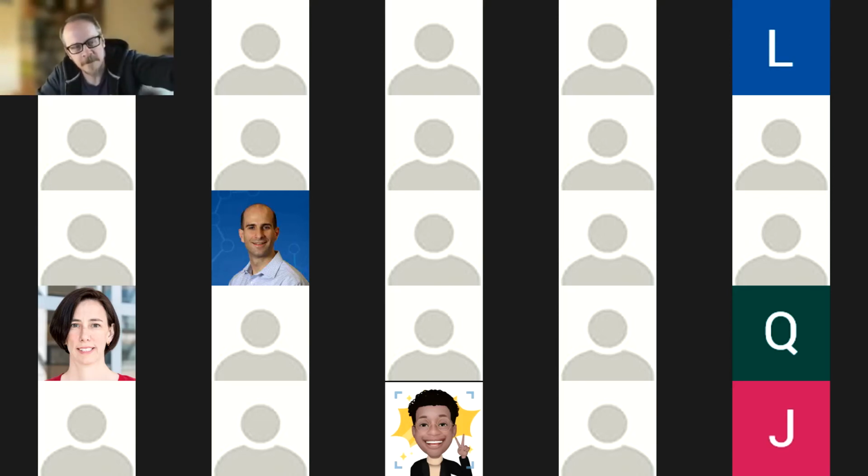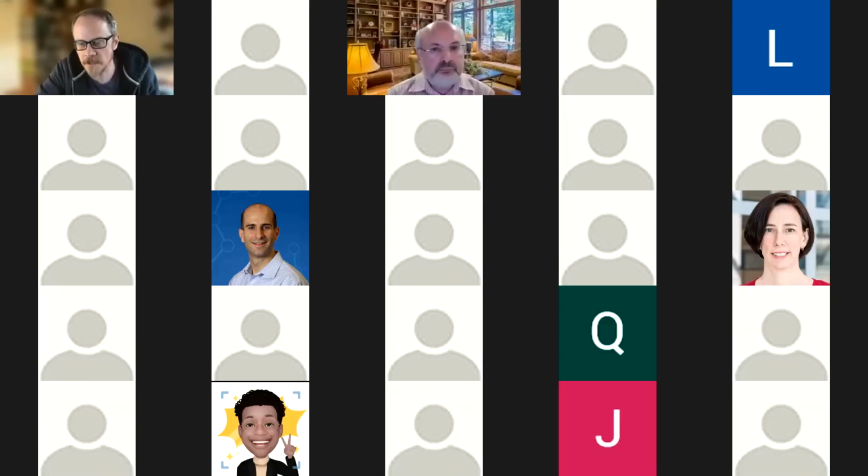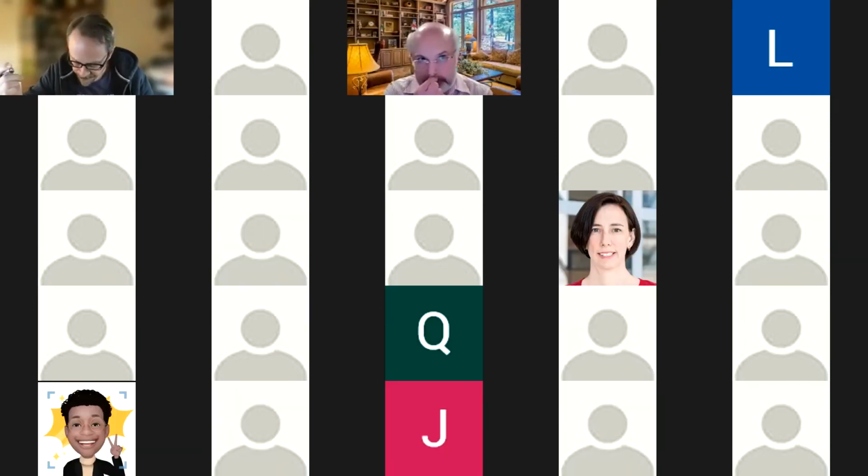Oh, that's fantastic. Thank you very much, Eugene. If anyone has questions, you can raise your hand in the reactions button. There's a raise hand, and I can unmute, and people can ask their questions directly. You could also send them by chat to me, and I would pass them on to Eugene. I see some coming in now. I had a couple of my own.